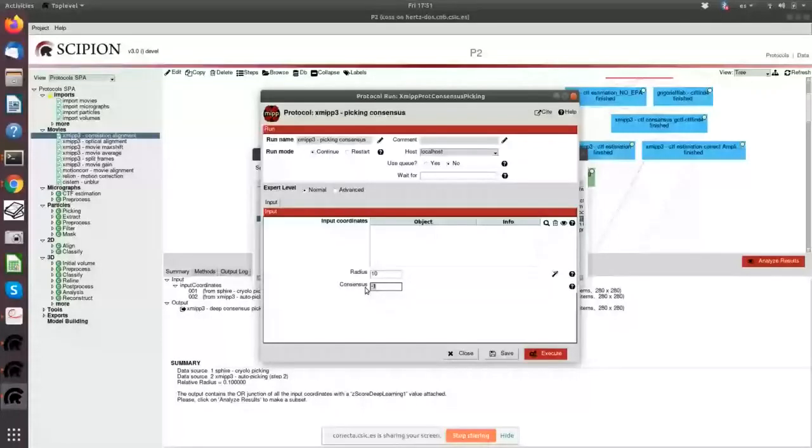So let's say that you had two pickings like these ones. This -1 was equivalent to 2. So -1 was the maximum, and it meant that you believed that something was a true coordinate if it was found by the two pickings. And then you could relax it and say, no, just by one. If you have 3 pickings, 4 pickings, you could be relatively creative there and say, I believe something is a coordinate if it has been found by at least 2 of them or by any one of them. So it was very flexible, but very naive. It was just checking coordinates.